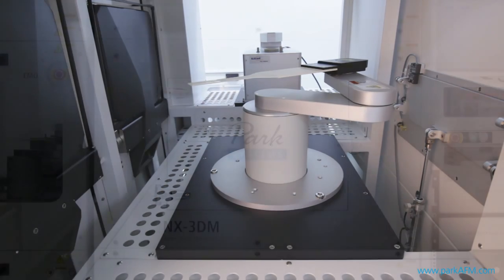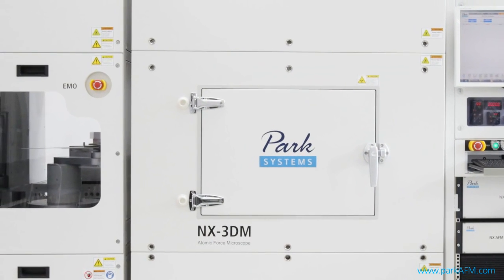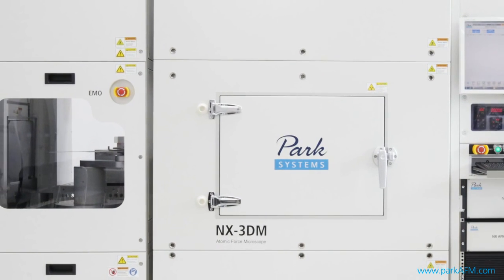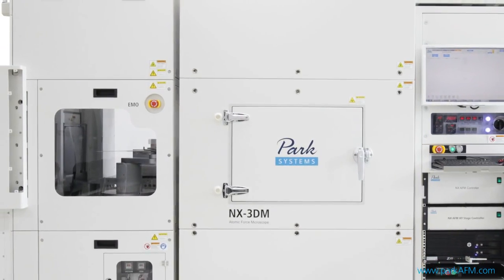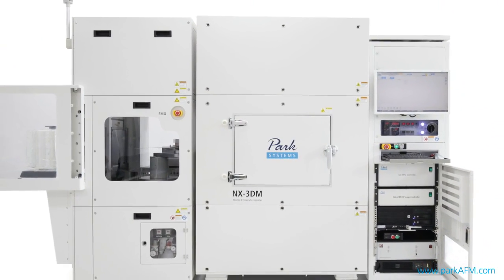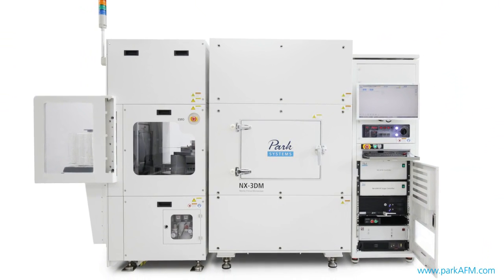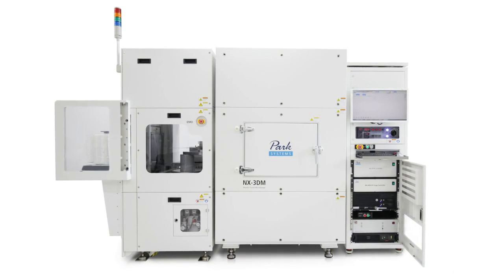As you have now seen, PARC-NX3DM's superb performance, accuracy, and high productivity will enable advances in nanoscale metrology never before seen in industrial applications. A truly indispensable tool for automated 3D material analysis.